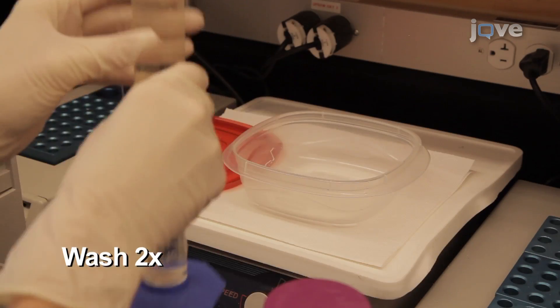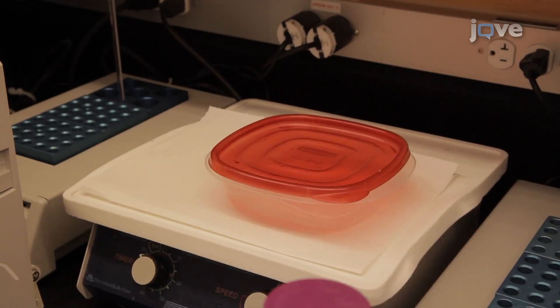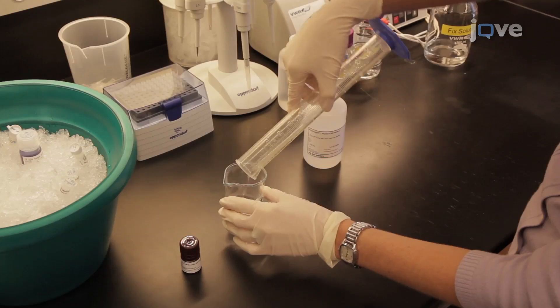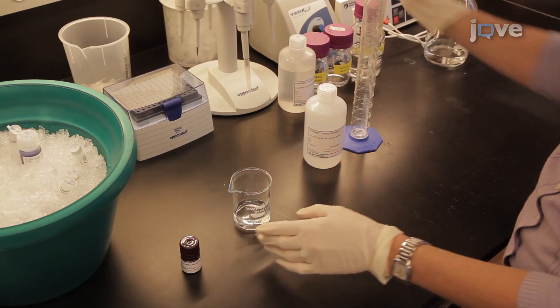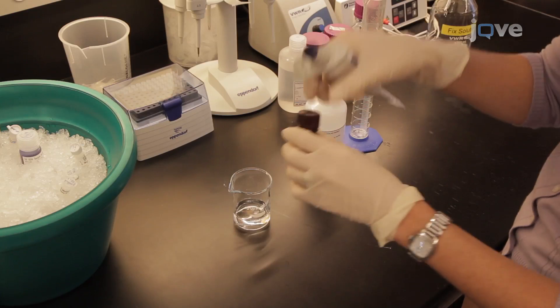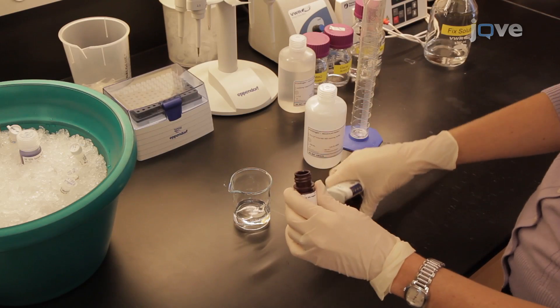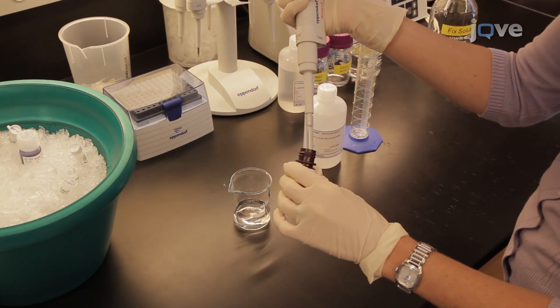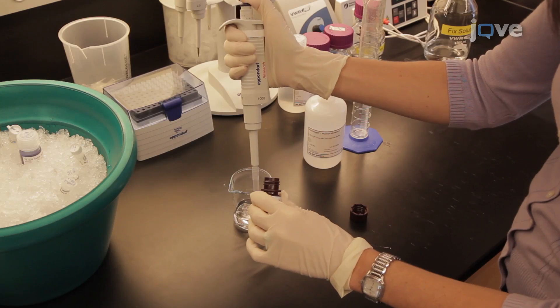Follow the incubation with two additional washes. While the gel is washing, prepare fresh Pro-Q emerald 300 stain by adding 500 microliters of the Pro-Q emerald 300 reagent solution to 25 milliliters of staining buffer provided in the kit.